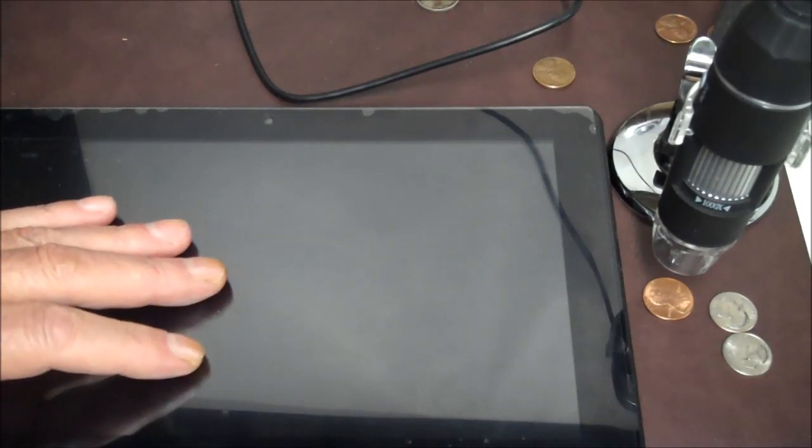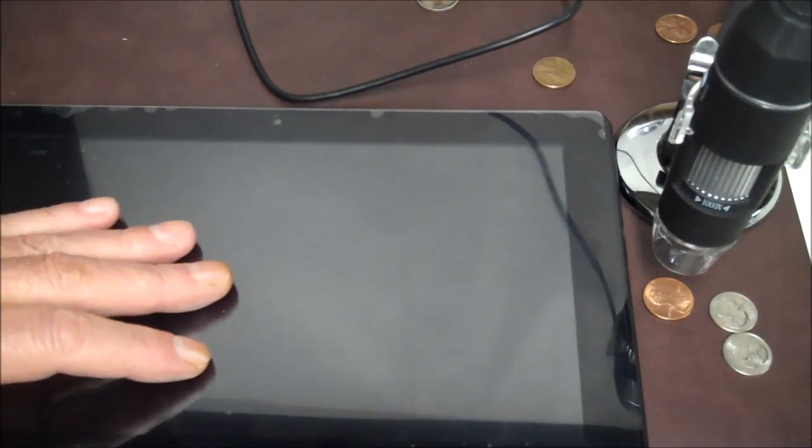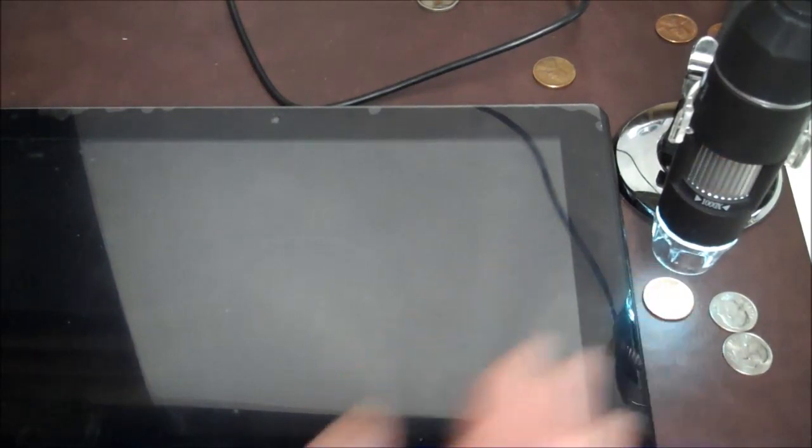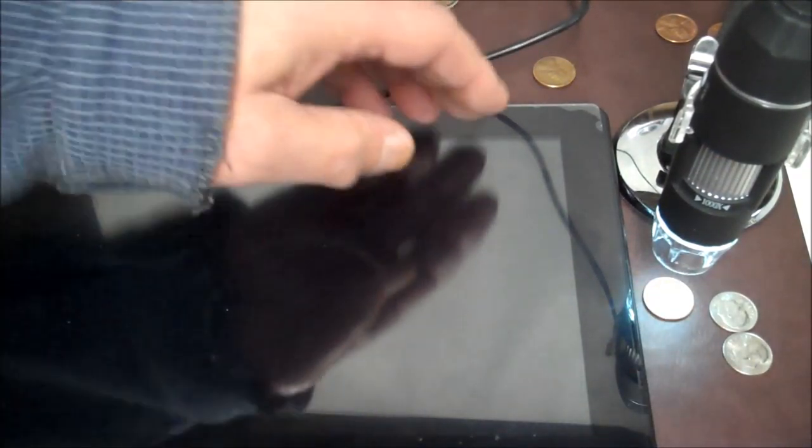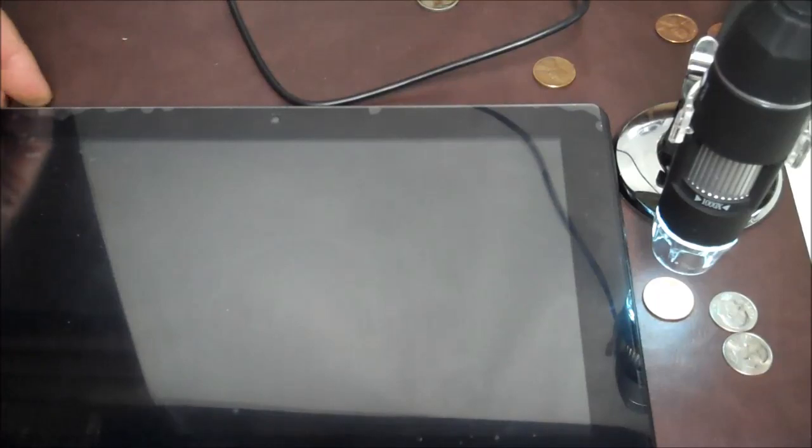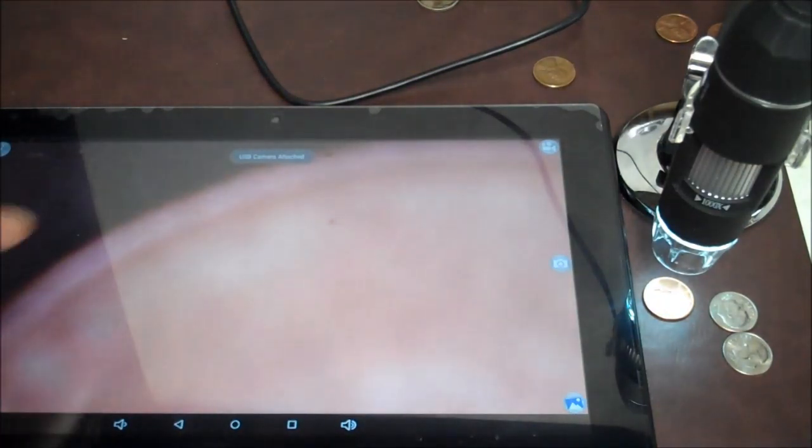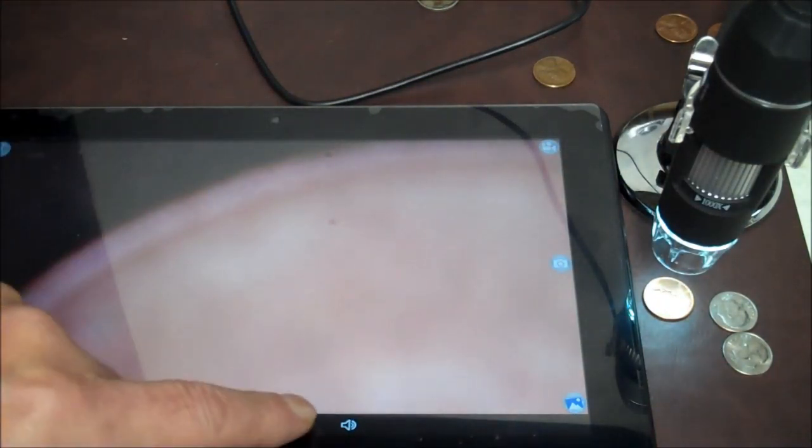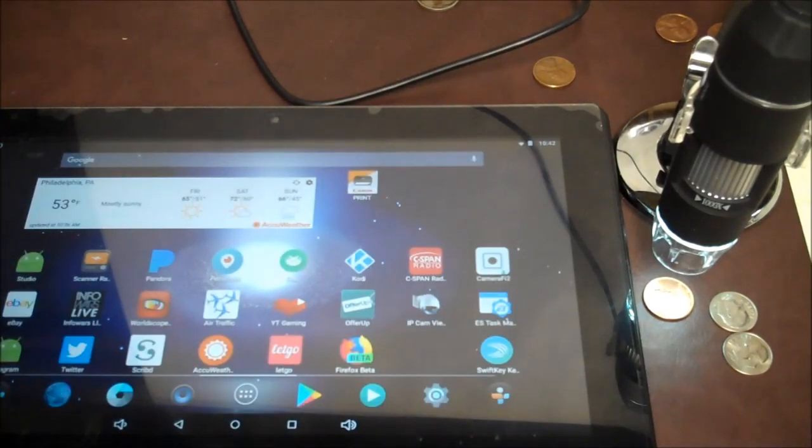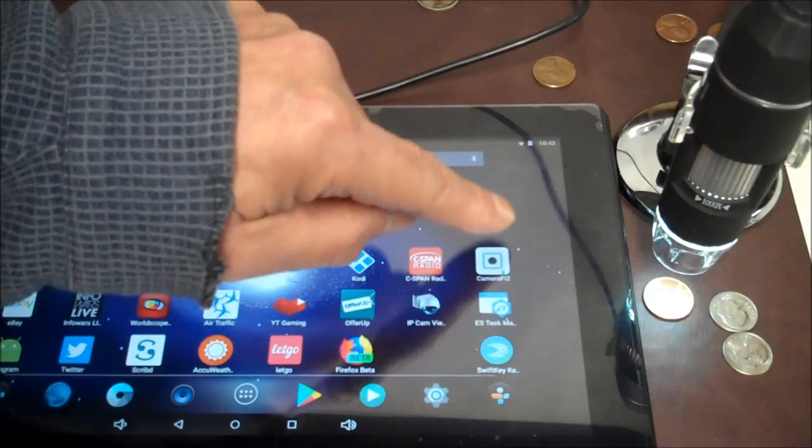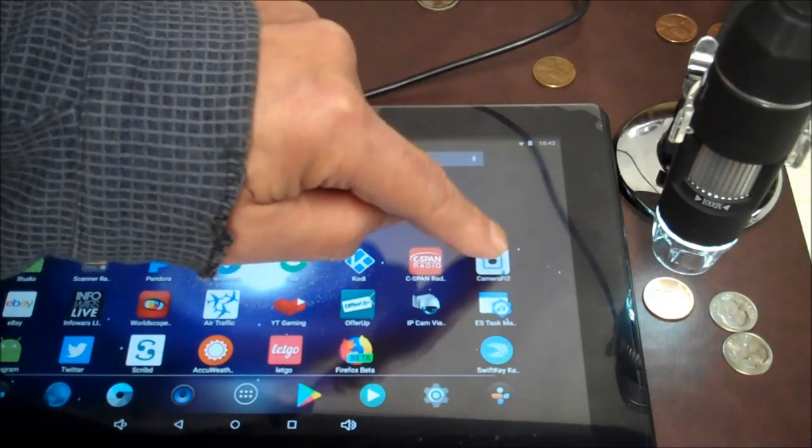So what I'm going to do is I'm using it on my tablet. I tried it on the computer. It worked and then it didn't work and then they crashed my computer. So I just said, oh, I'm just going to use it with the tablet. You just plug it in. My tablet has a USB port. Let's turn it on. Get this started here. Now this is my, I set this up by default and then it shouldn't have because I don't like it anymore. What I'm using is CameraFi 2. That can be found in the Play Store CameraFi 2.